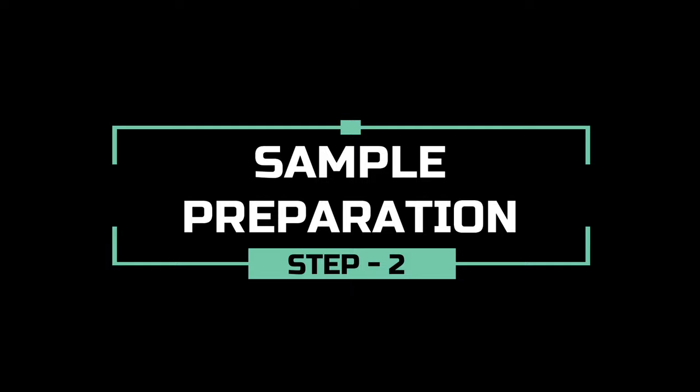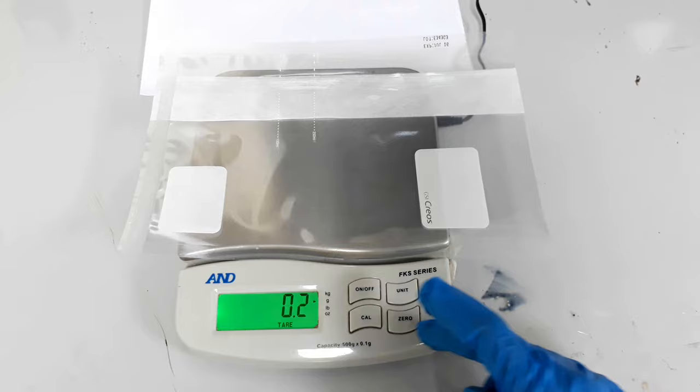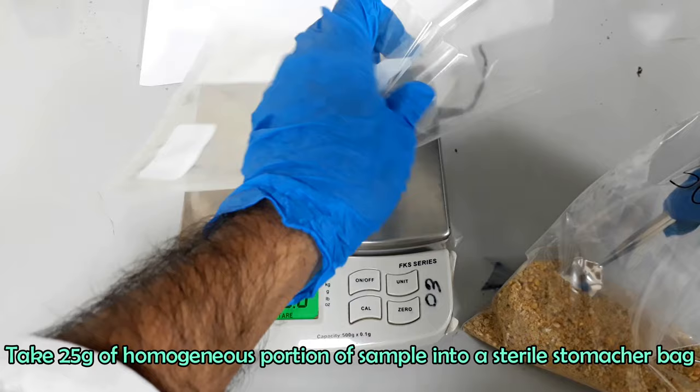Now we will prepare our sample. Use a sterilized spoon to transfer the sample. Spray the spoon with 70% isopropyl alcohol if there is any chance of contamination. Take 25 grams of homogeneous portion of sample into a sterile stomacher bag.